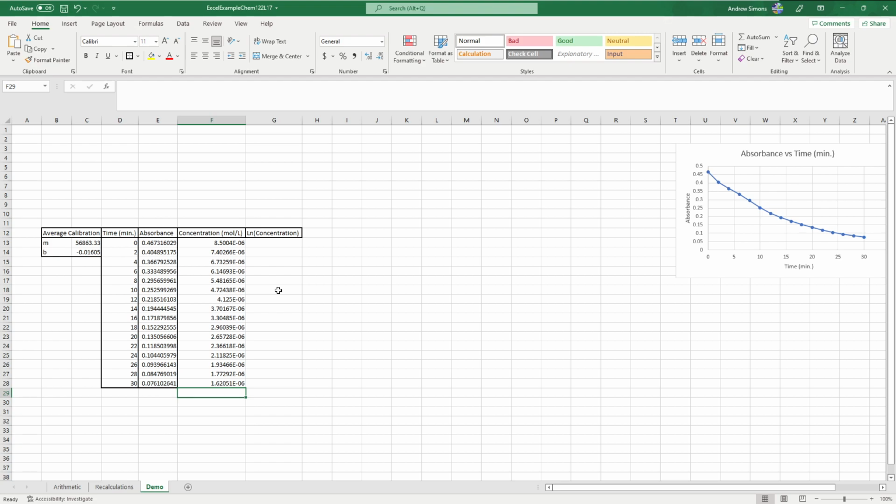Okay, that's how you get concentration using the classic y equals m times x plus b, where x is concentration and y equals absorbance. I believe most of you guys kind of got that. So obviously if you have more questions, you can email me. But for the most part, you can just back up the video and then listen to when I explained it the first time. So that's kind of neat.